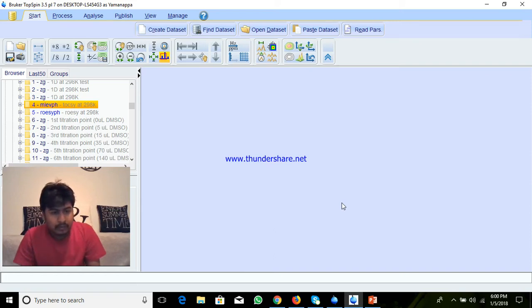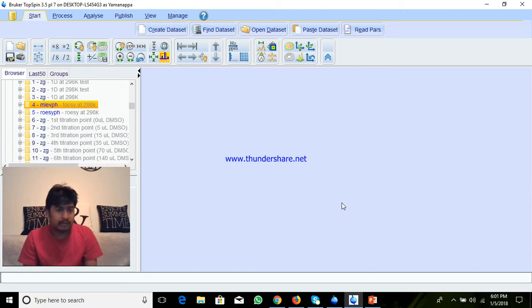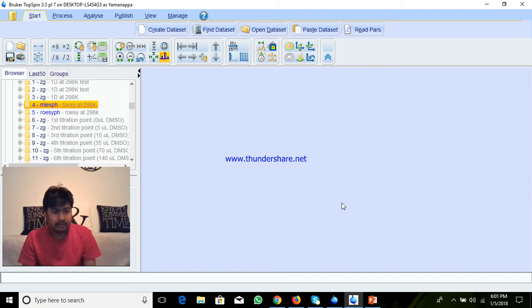Hi, today I am going to explain how to process two-dimensional homonuclear NMR data using TopSpin.